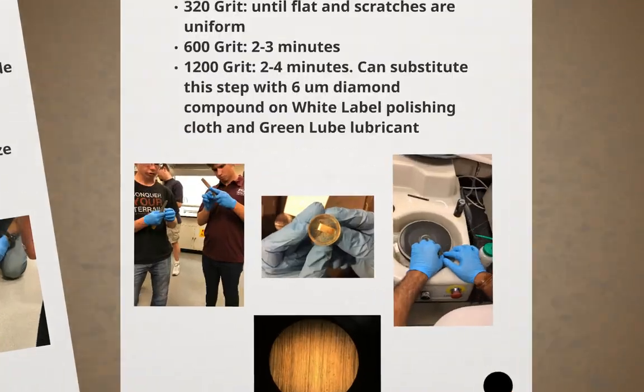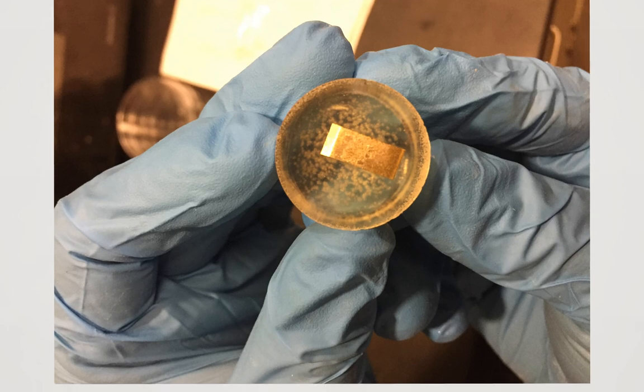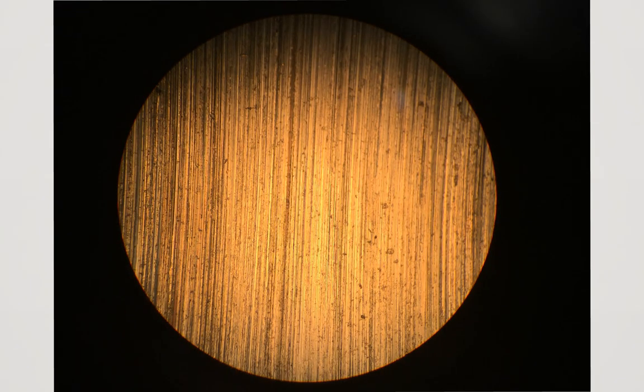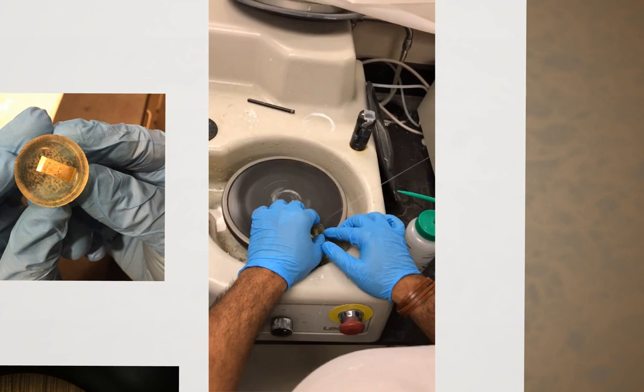This is an example of a sample set into the epoxy mold. We can see that it is not quite flat due to the reflectivity of one side in comparison to the other. This picture was taken after one of the lower grit grinding steps. You can clearly see the coarse scratches in the epoxy of the sample. The basic grinding process is shown in the video.